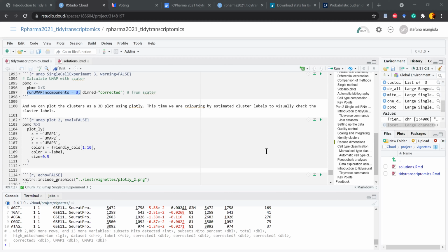And later on, I will show you what happens with the Seurat objects. I will show you how the transition from single cell experiment to Seurat, when we use our tidy abstraction, is very easy. So basically you can do whatever I did so far with the exact same code, I mean, for what is data set manipulation with Seurat, with no differences.